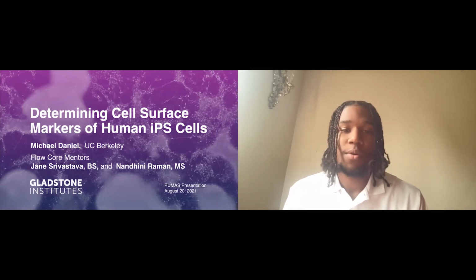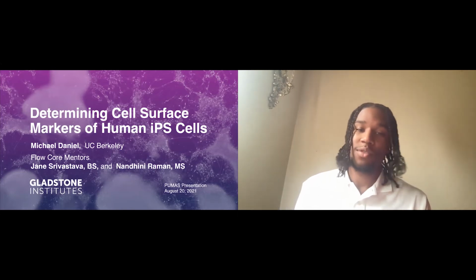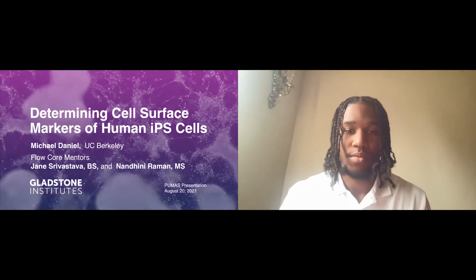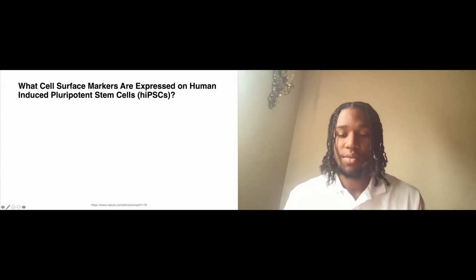Over the summer, I worked on stem cells with Jane and Nandhini in the flow core, and we worked on determining cell surface markers of human-induced pluripotent stem cells. The question we aimed to answer was, what cell surface markers are expressed on human-induced pluripotent stem cells?